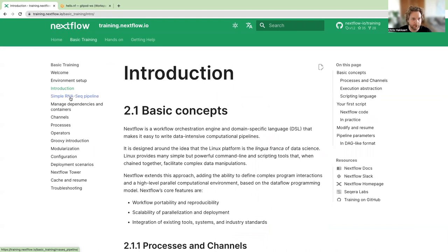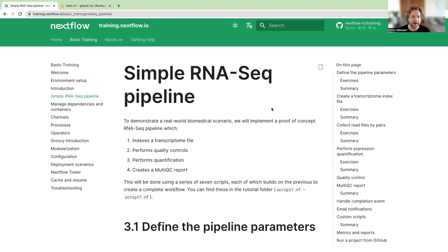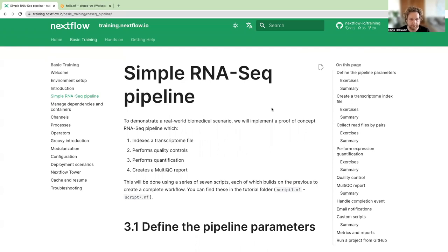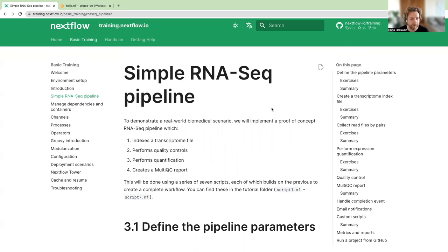Next, we'll move on to the simple RNA-seq pipeline, which is a demonstration of a real-world biomedical scenario. We call it a proof of concept because it isn't a real RNA-seq pipeline — it's just using some commonly used bioinformatic tools as an example. If you're unfamiliar with RNA-seq and coming from outside the life sciences, please don't worry too much about what the tools are doing. Focus on the big concepts rather than exactly what's happening with each script.